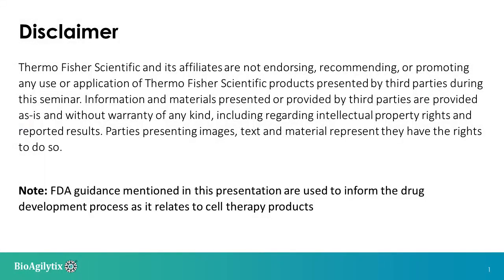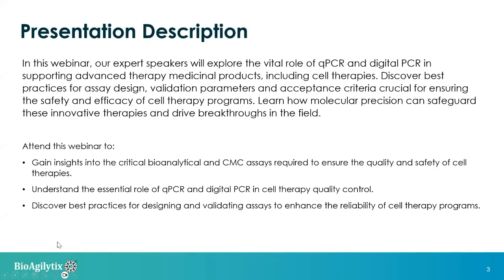Thank you for that introduction. It's my pleasure to talk about cell therapies today with you. This is a quick disclaimer slide. And just a brief overview of our presentation today. We're going to be speaking about the role of molecular workflows, so quantitative PCR and digital PCR, in supporting one of the advanced therapeutic medicinal products, and that will be cell therapies. So we're going to talk more about the bioanalytical and CMC assays that are required to support these types of modalities.